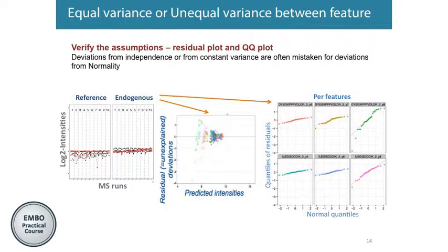Essentially you take the intensity, you subtract what you expect to be explained by the systematic part, and the residual is the leftover. We see that for lower predicted intensities there is more variation, so there's more unexplained part than for high intensities. It means there's more unexplained variation at lower intensities. This is what it means that we have unequal variance. For low intensity fragments, there's more variation which is not explained, and you can see this in the residuals.